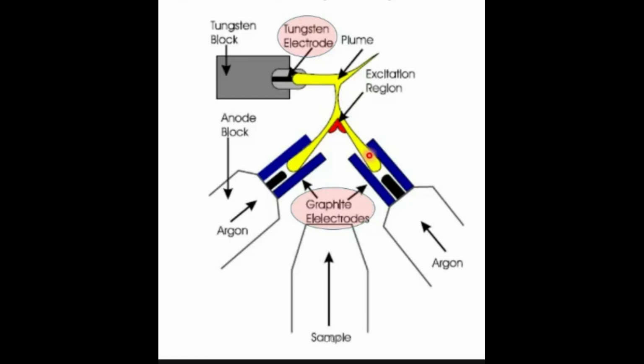The lower two are both anodes, and this is the cathode. These two are anodes. And you can easily say that although it is having some distance above that anode, it is in a way resting on them. There is a very small gap between them, but it is in a way resting on them.